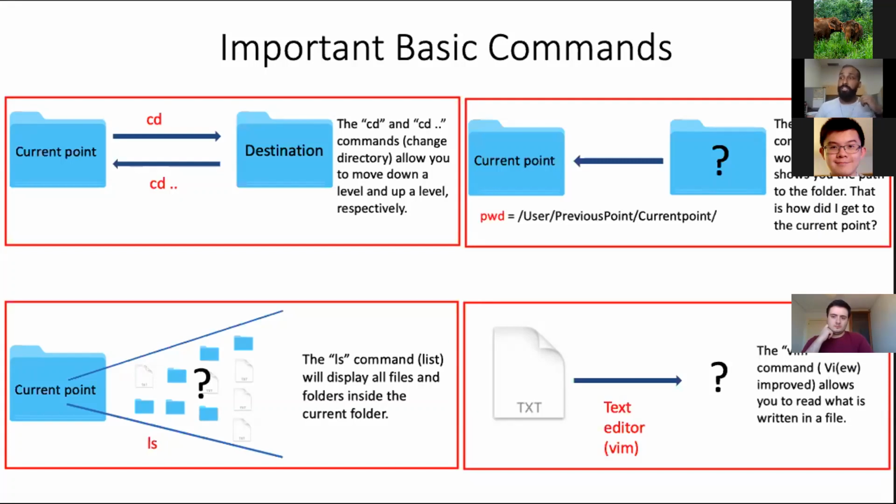Next, we have the ls command. This stands for list. Typing ls and pressing enter will list all the files present in the directory you're currently in. I forgot to mention, if you guys have your command line open, you can try this out as we do it, and I will be doing live examples as well as we move forward with the variant calling stuff. If you do encounter errors or it doesn't work, feel free to email me later. I already sent my email address.